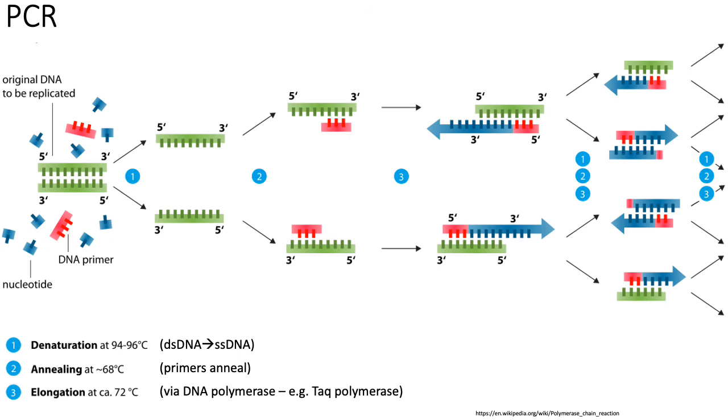I'll just briefly mention PCR here. Particularly when it comes to bulk RNA sequencing, PCR is again one of those necessary evils that still gets used frequently, in particular for bulk assays. When we get to the single-cell RNA-seq assay, we'll talk a little about how some of the problems with PCR have been mitigated.